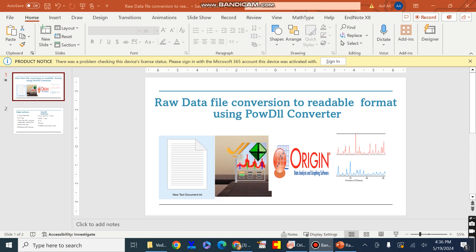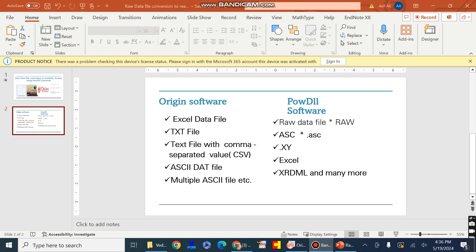We need to convert the raw data file into a suitable format which is supportable for the Origin software. With the help of Origin software we can draw and plot the raw data file in the form of an Excel file, a text file, a text file with comma-separated values known as CSV, ASCII data file, and multiple ASCII file formats, and many more.